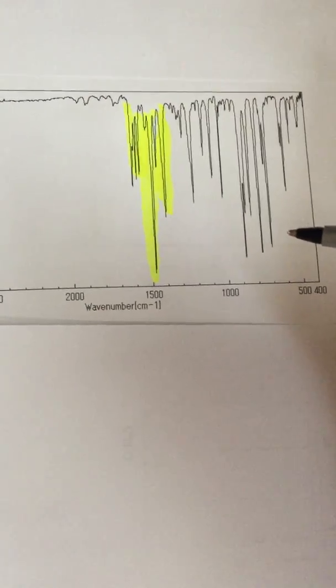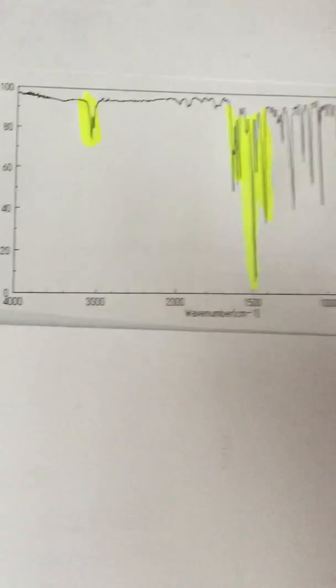Okay, so today we'll be discussing how to determine what a structure and the compound is if we only have IR and MS pictures. So something like this is an IR diagram, and it looks like a whole bunch of squiggly lines until we decipher what it really means. With IR, there are actually 5 different zones within the wave number diagram.